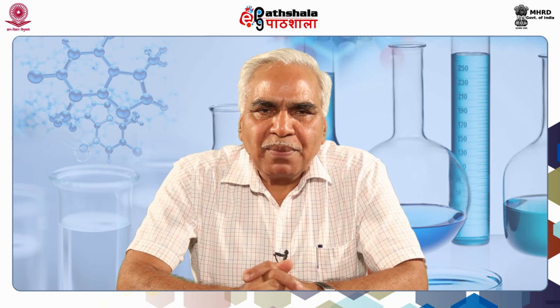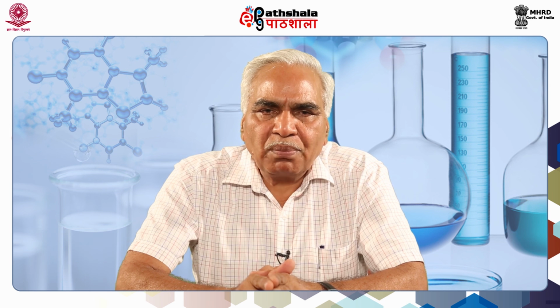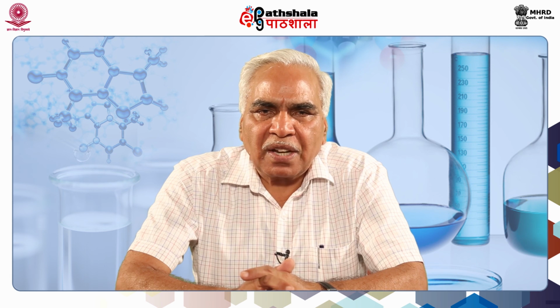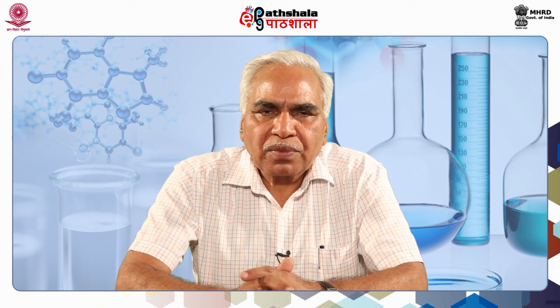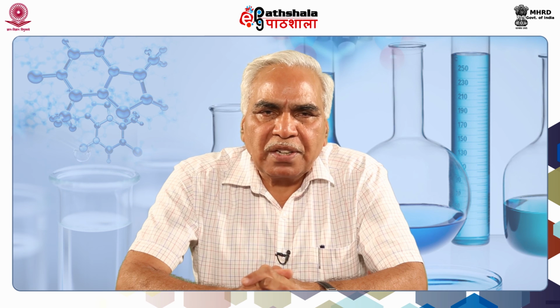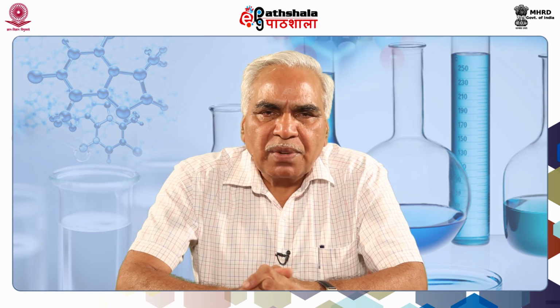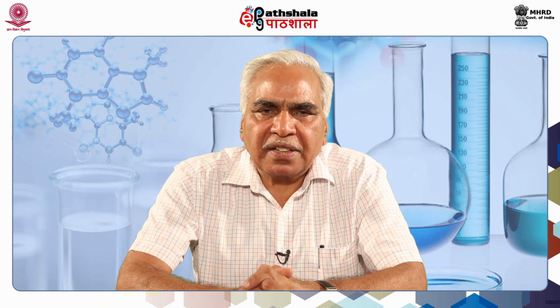Dear students, let me summarize the topic of discussion. The technique is performed in multiple steps, and you should be careful in every step for a successful blot. A common problem is either poor transfer or no transfer of DNA from gel to membrane. Probes can also lead to non-specific detection. Therefore, the probe is required to be used under appropriate reaction conditions, which give signal only in the presence of target DNA.